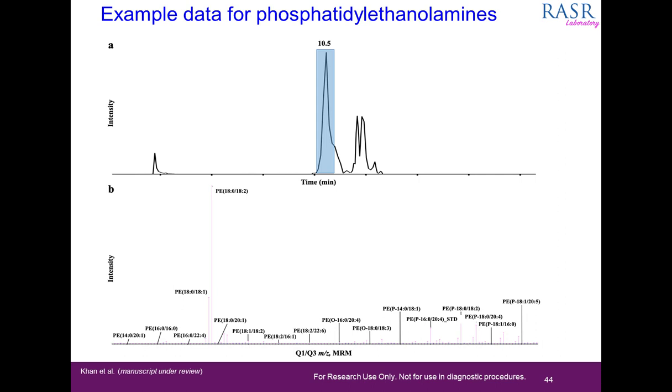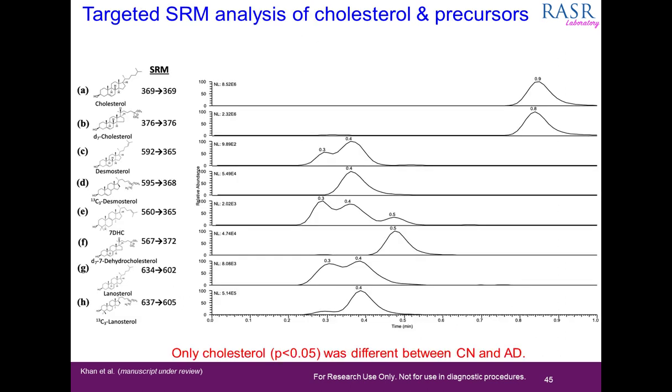And right now we're just really trying to learn how to handle these data and work through them, but we're really excited about the quality of the data that we're getting from both platforms. And even though I'm not showing you that, we do have some data that support we see similar changes with the targeted platform as we do with the untargeted platform.